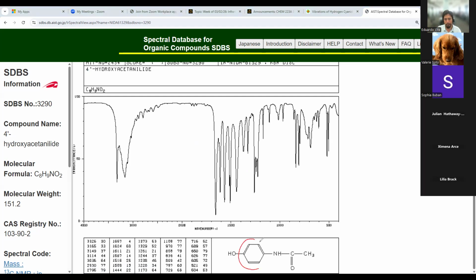We have this aromatic ring right here. Since we have an aromatic ring, the whole spectra should be a little sharper. And you can see there's a lot of sharp peaks, right? So that's already some confirmation. Since we have an aromatic ring, we should have a small pattern of foothills at around 1700, 1800. And you can see right here, we call these overtones.